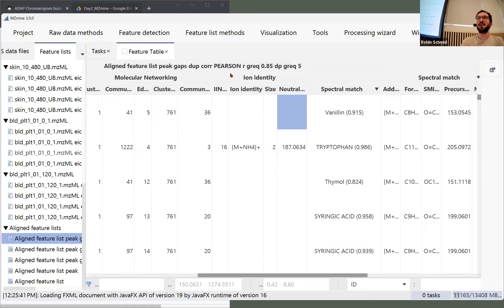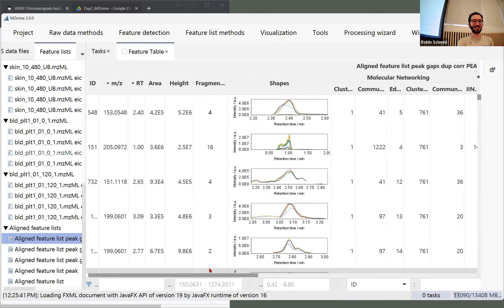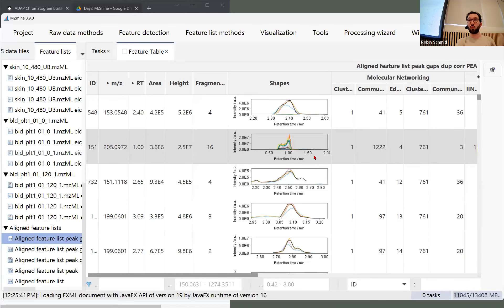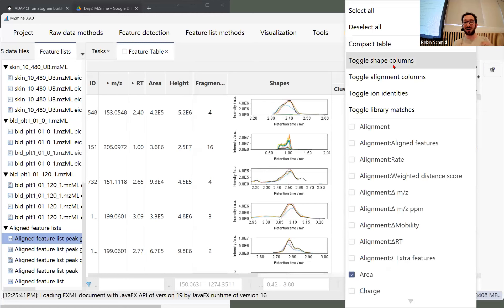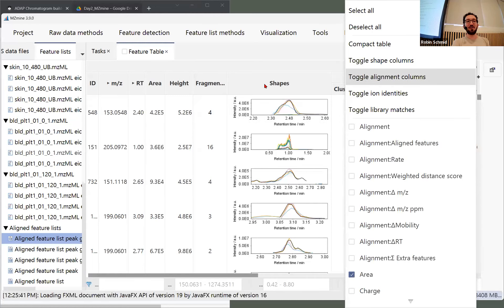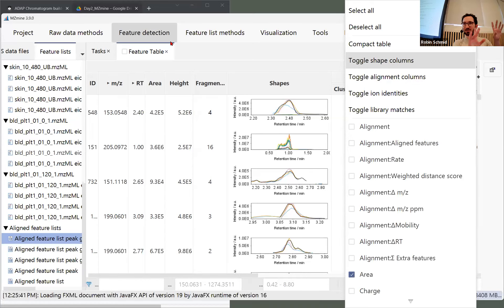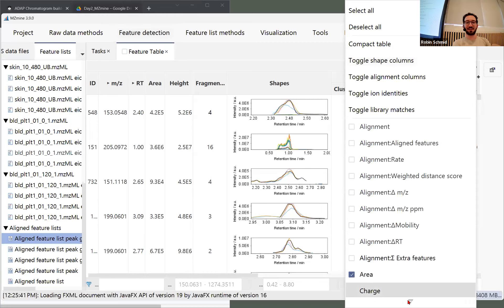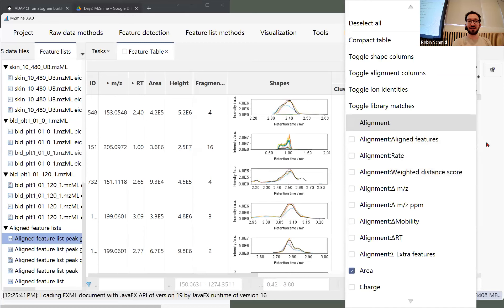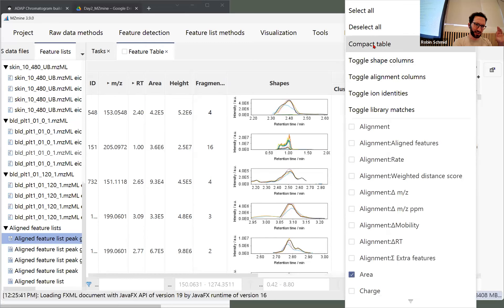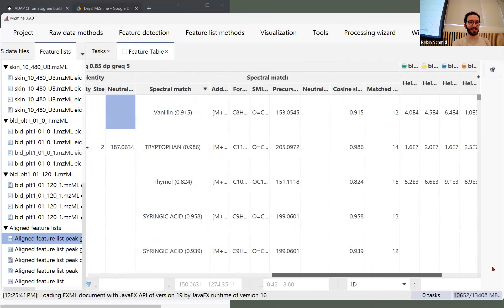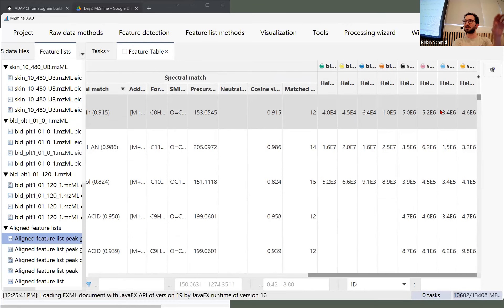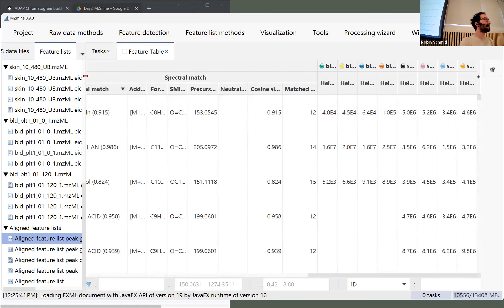You may have imported too many samples which slows down plotting thousands of chromatograms. If you have 100 samples, you're probably not interested in looking at all the shapes. At the top there's a toggle shape column — with many samples it takes time, but you should be able to close the window to kill all tasks, or right-click and stop all running tasks. There's also a compact table mode which drops a lot of columns like m/z and state per sample so you don't see that for every sample.